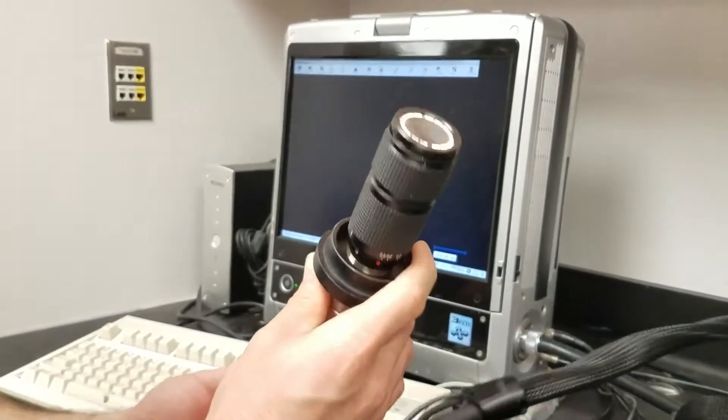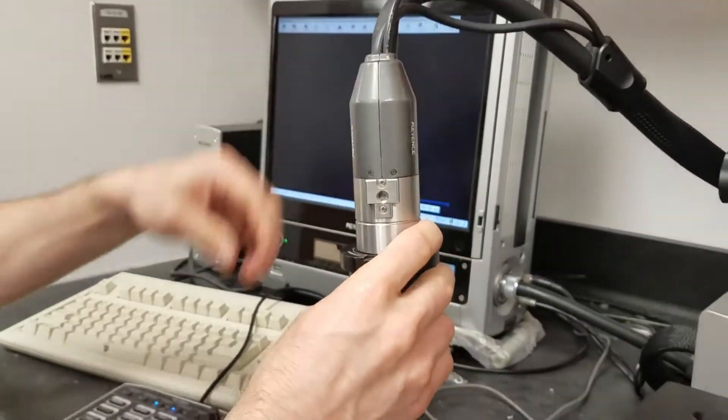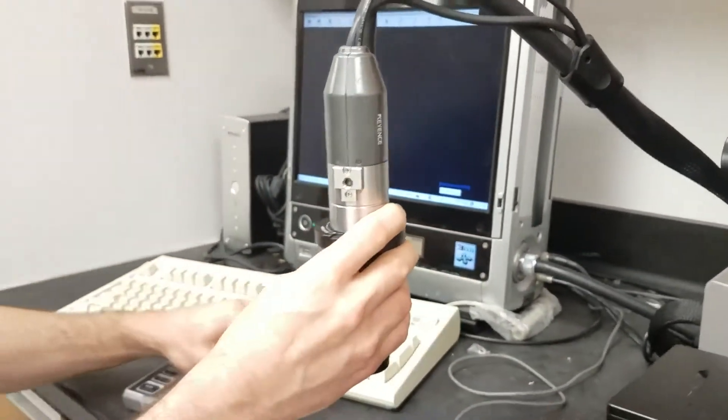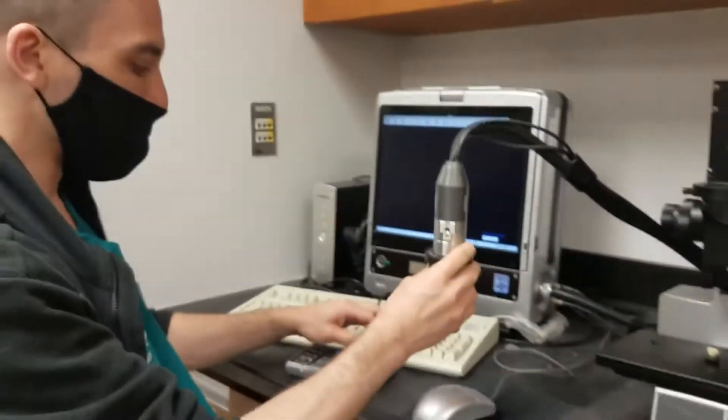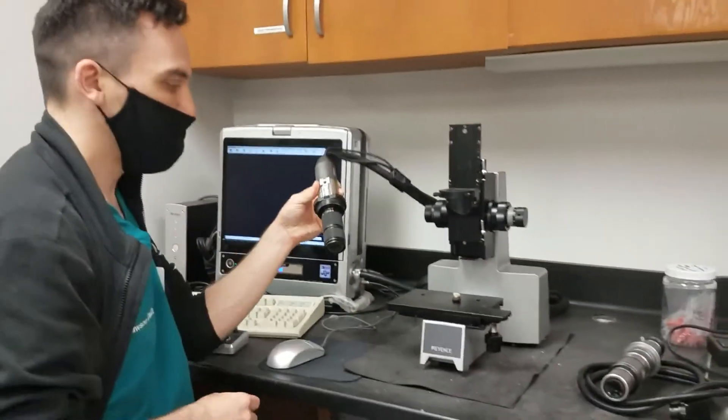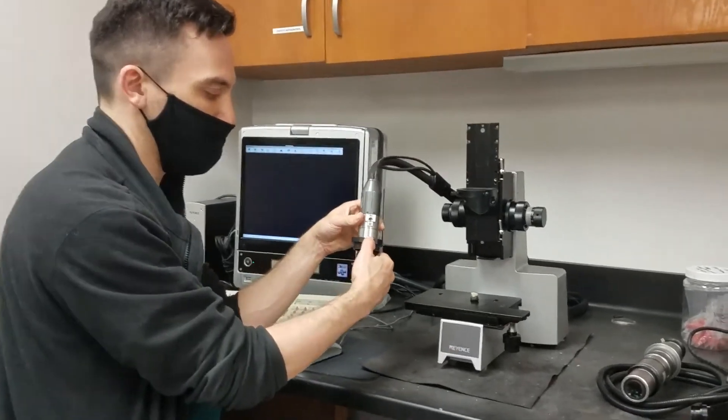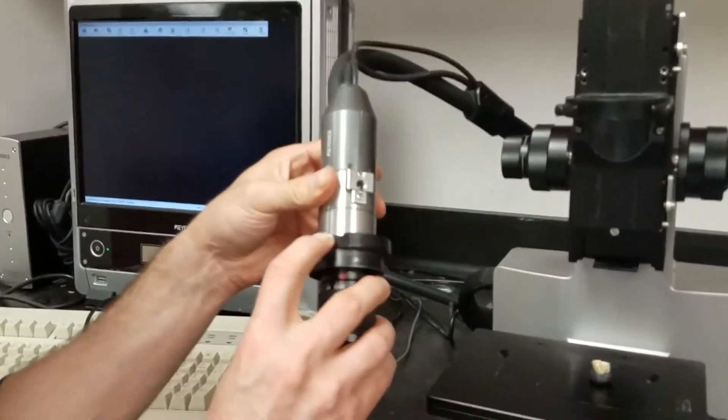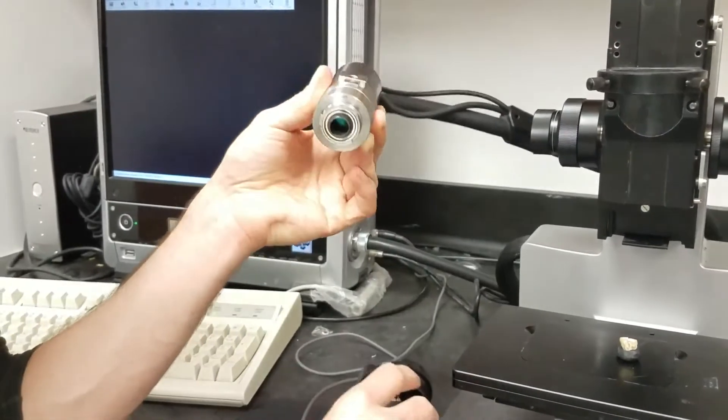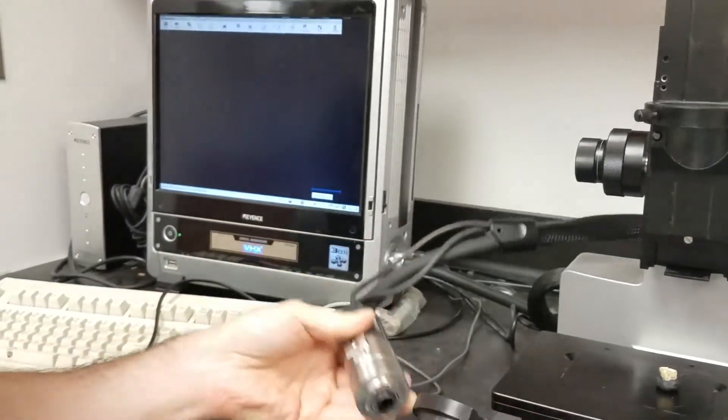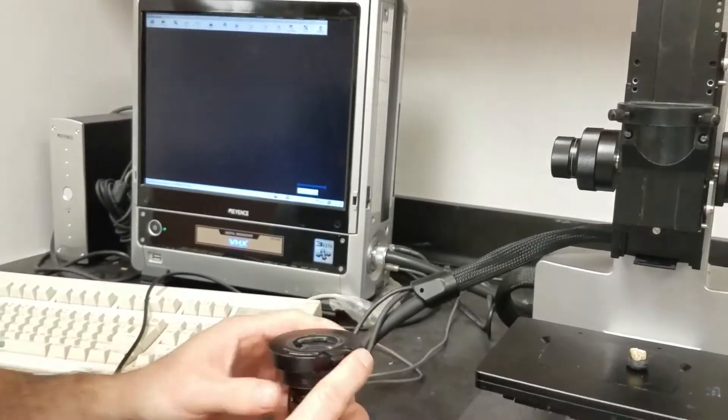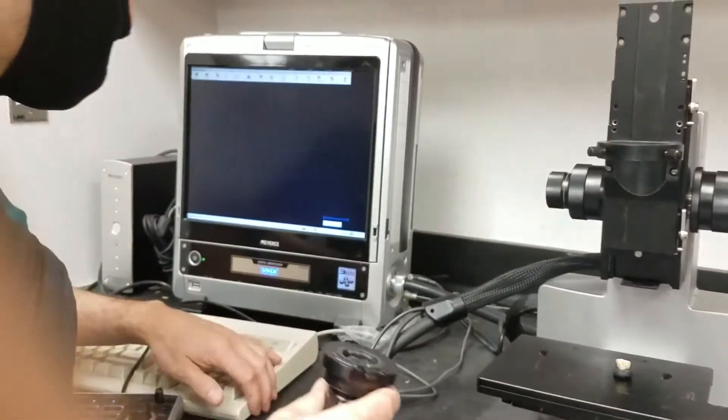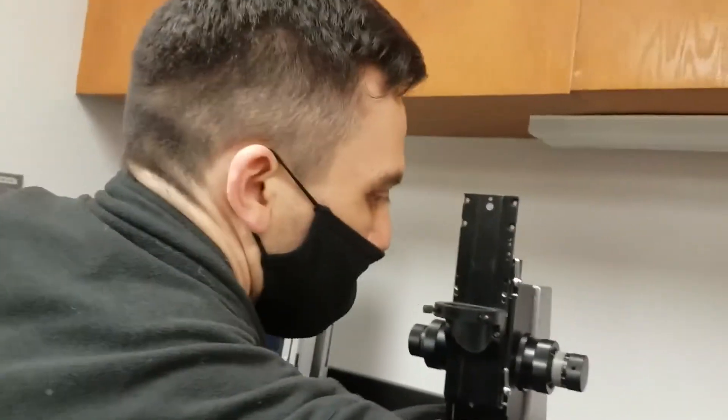So that's the low magnification lens. Let's turn down the shutter and the light and I'll switch out the lenses. So to switch out the lenses, there's a little button here that you press. And then you twist this and you can separate. And then you want to make sure that after you do that, that you put the cover back on it. Okay, here's the cover. So I put the cover back on here to protect it.